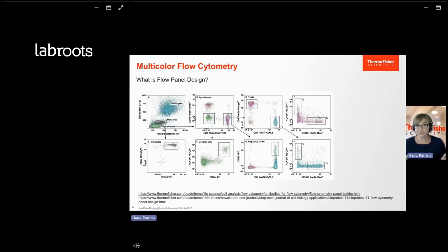One of the biggest challenges in multi-parameter flow cytometry is selecting the right combination of fluorophores and antibody conjugates. Only this makes it possible to keep the need for compensation, but also the spillover adjustment, to a minimum.